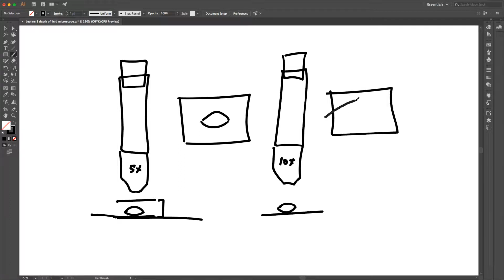First of all, now your field of view is smaller because you're using a higher magnification, and now potentially your subject matter doesn't fit inside the view of the camera. So the edges are missing here on either side of the sample. Also, you would have a narrower depth of field, like just this region is in focus, but there are parts of the sample, like this part and the part that's right up against the microscope slide, that are still visible. It's just that it's out of focus.